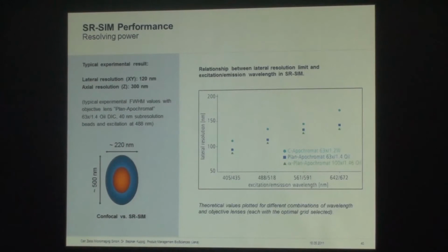But what's the period exactly compared to that? It is, if I remember off the top of my head, 0.28 microns for the smallest grating, so the spacing. Is it meant to match the diffraction spot of your objective? Based on the wavelength and the NA, yes. And it goes up to 0.33 or 0.35 for the 642 nanometer laser.